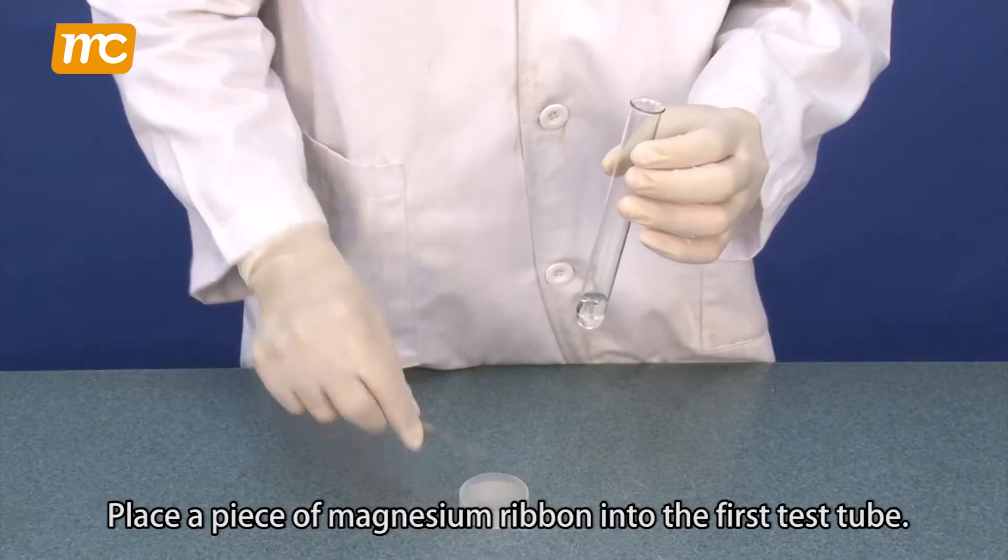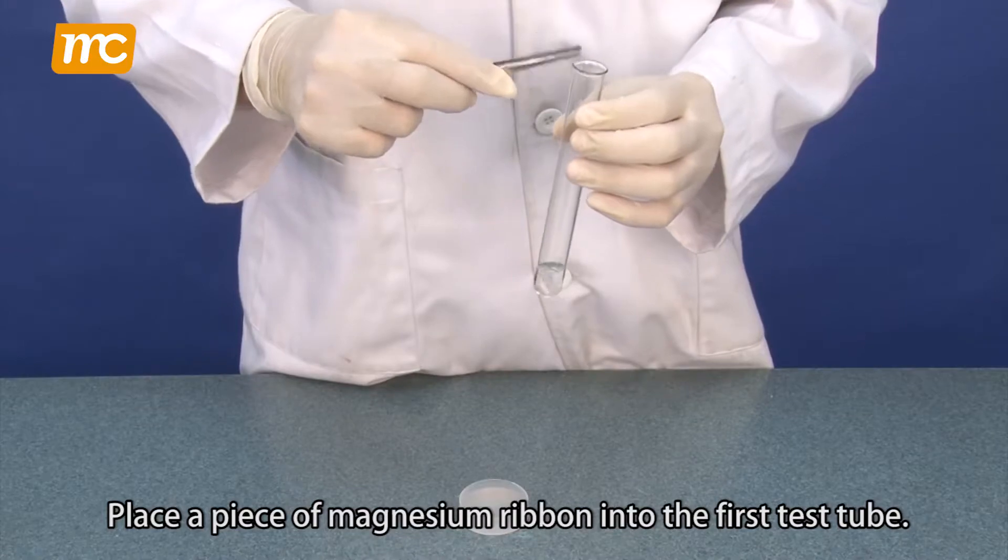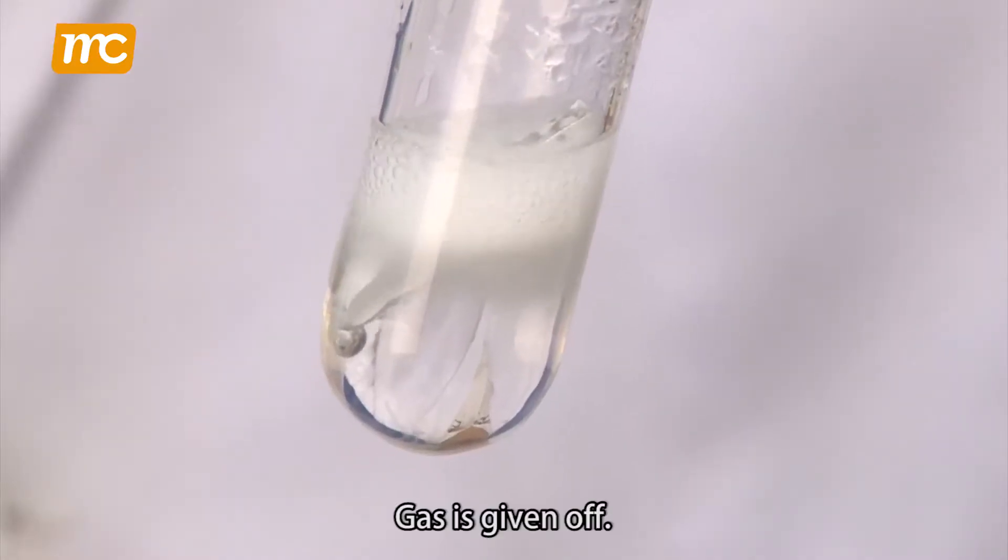Place a piece of magnesium ribbon into the first test tube. Gas is given off.